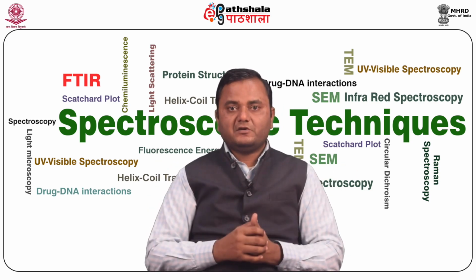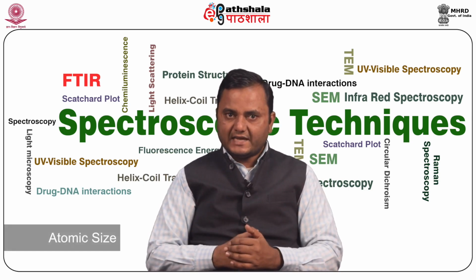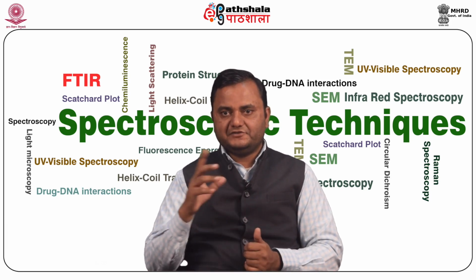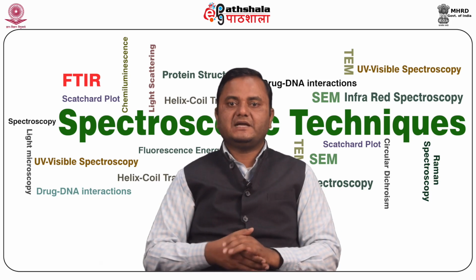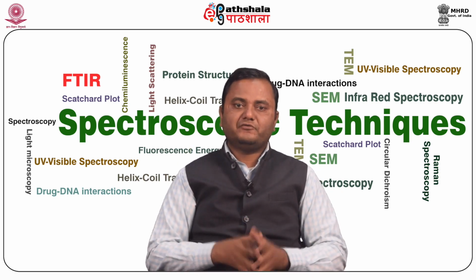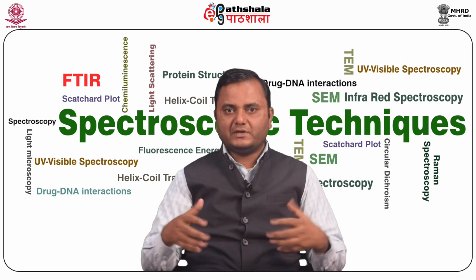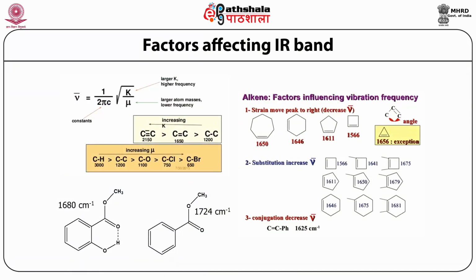So the position of the spectral band is dependent on the bond strength and atomic size, and the intensity of the peak results from the efficiency of the coupling. For example, a vibration that has a large change in the dipole moment creates a larger electric field with which a photon can couple more efficiently, and thus produces more intense bands in the IR region. We discussed the factors affecting the IR bands.